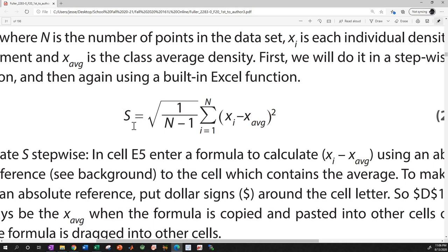Well, this function for standard deviation, when I made this, I went through like just a dry run, and I'm like, why is it not calculating it right? It didn't agree with what Excel had from its standard deviation function. Well, you know, I had to pull out my statistics book and find the function. You know, I keep all my textbooks from my undergrad. You should too. This check mark, this line, it should actually go over all of this.